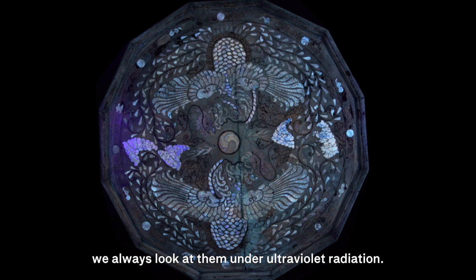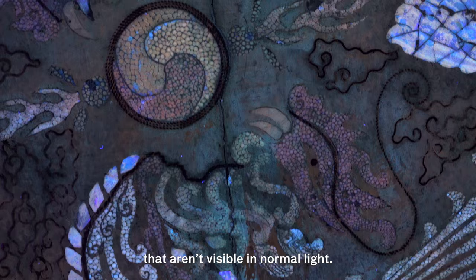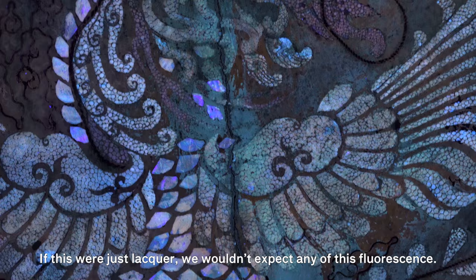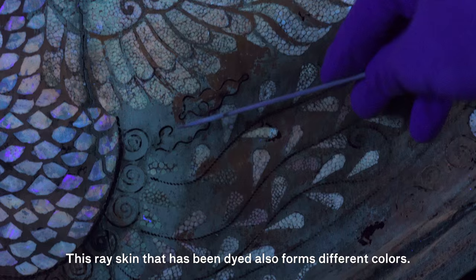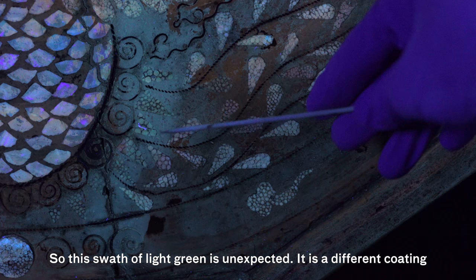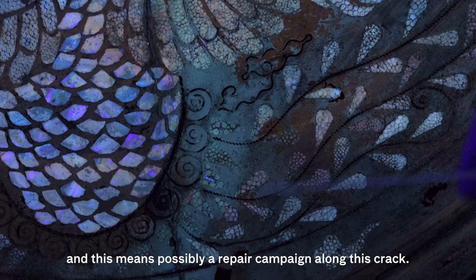In addition to looking at the object under normal light, we always look at them under ultraviolet radiation. Examining objects under UV often helps us to identify materials that aren't visible in normal light. If this were just lacquer, we wouldn't expect any fluorescence. The mother of pearl is fluorescing different colors, and this ray skin that has been dyed also forms different colors. This swath of light green is unexpected — it is a different coating from the rest of the surface.